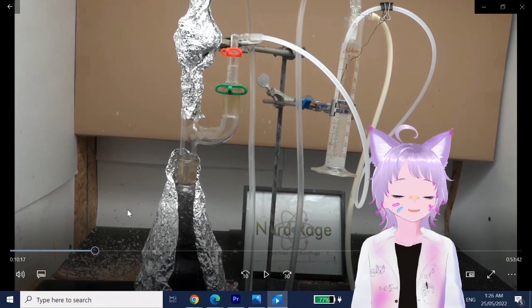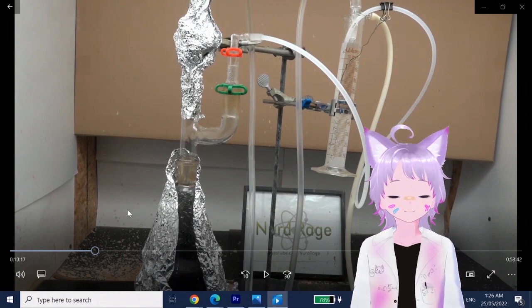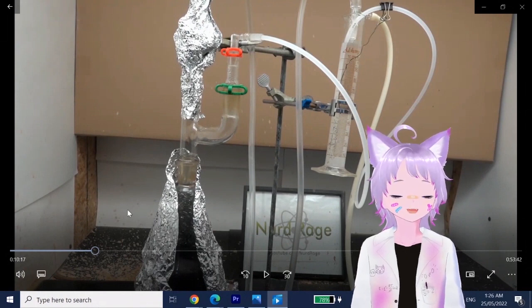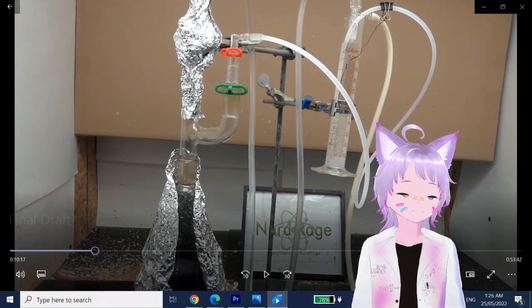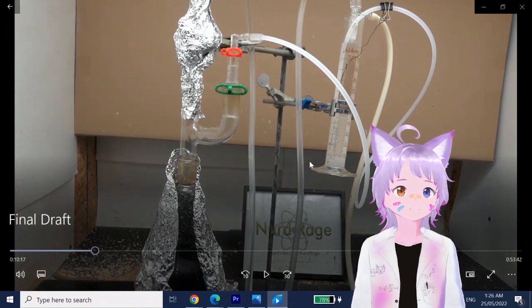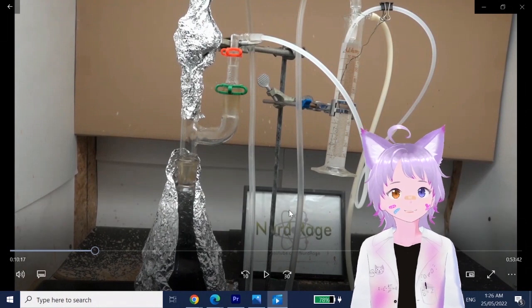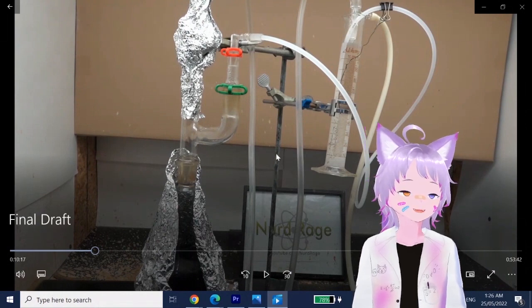Yeah, but we don't even need to worry about that if we have an addition funnel, because then you can just add everything slowly and it will never get to that concentration where it starts to react. Yeah, and we can just constantly remove the water and we're adding more sulfuric acid at a slow enough rate. Therefore, we can do everything at once instead of this. Think about it. We optimize his steps, right?